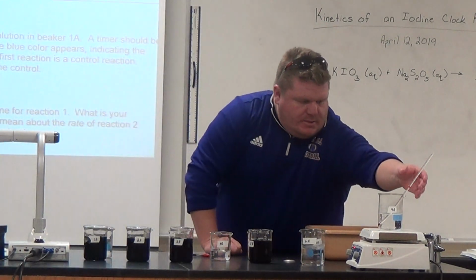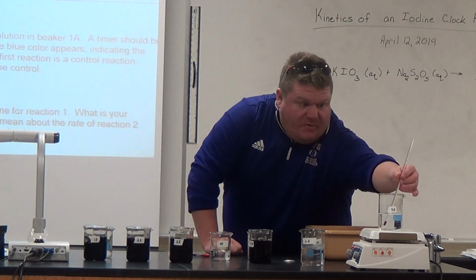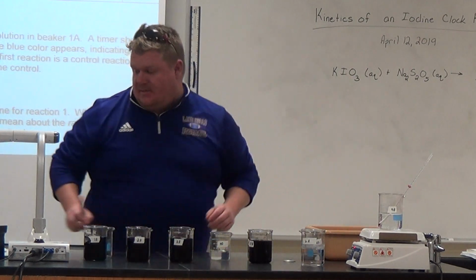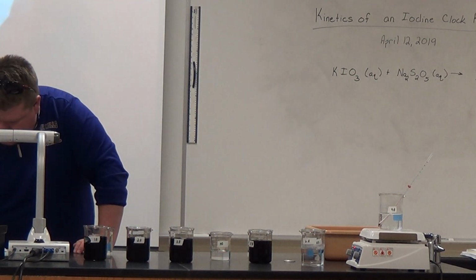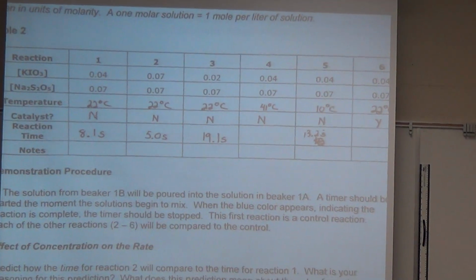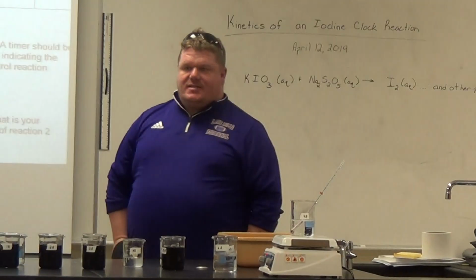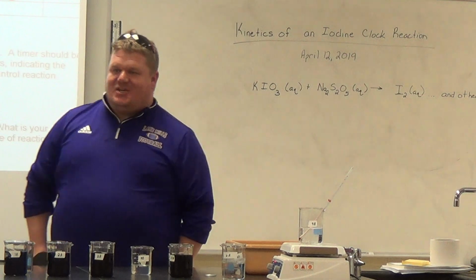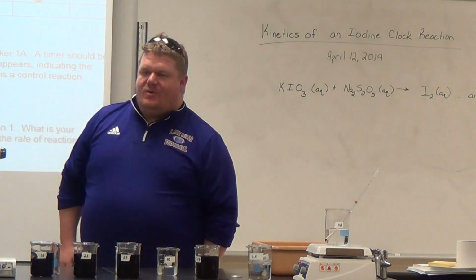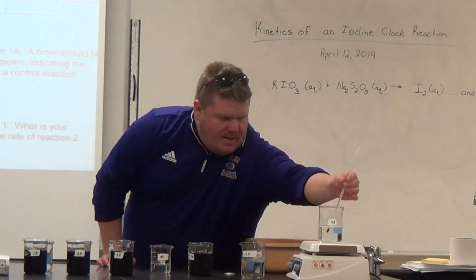Okay. So this is warm enough now. All right. So now we're back to number 4, and this is at 41 degrees Celsius. 41 degrees Celsius is where we are for number 4. All right. Anyone like to make their prediction known for that? Trey. Fast compared to number 1, yes. Okay. Let's find out.